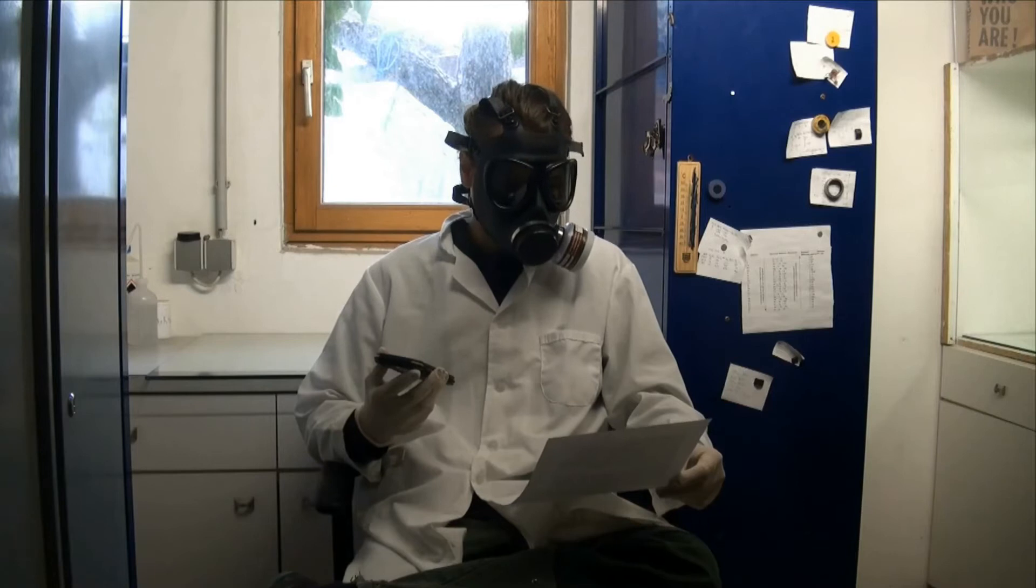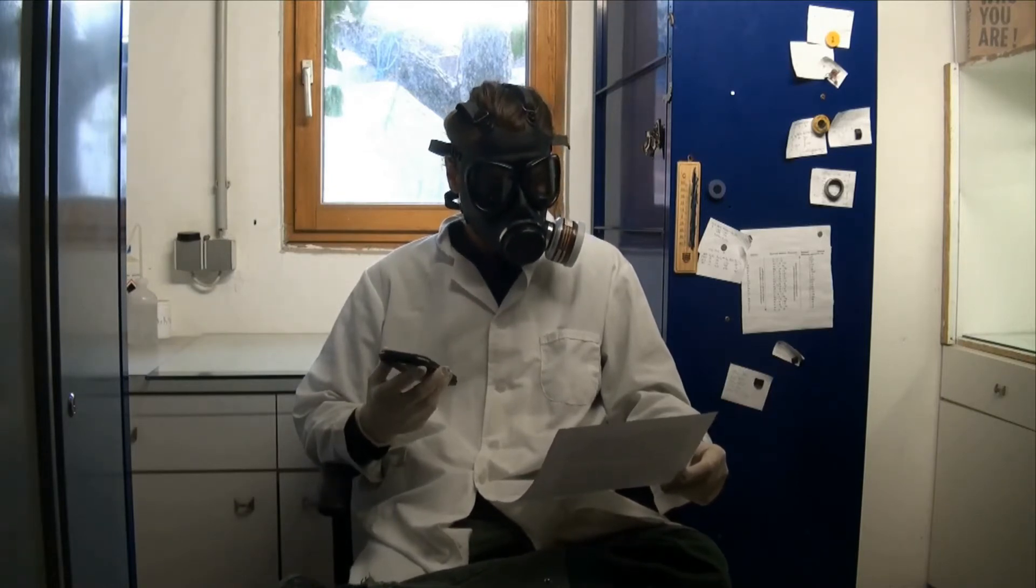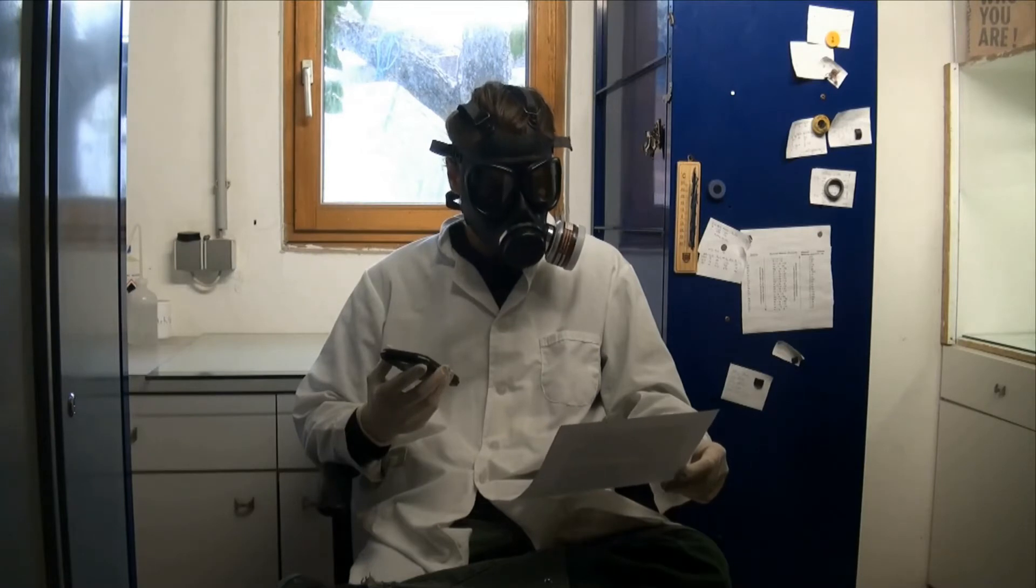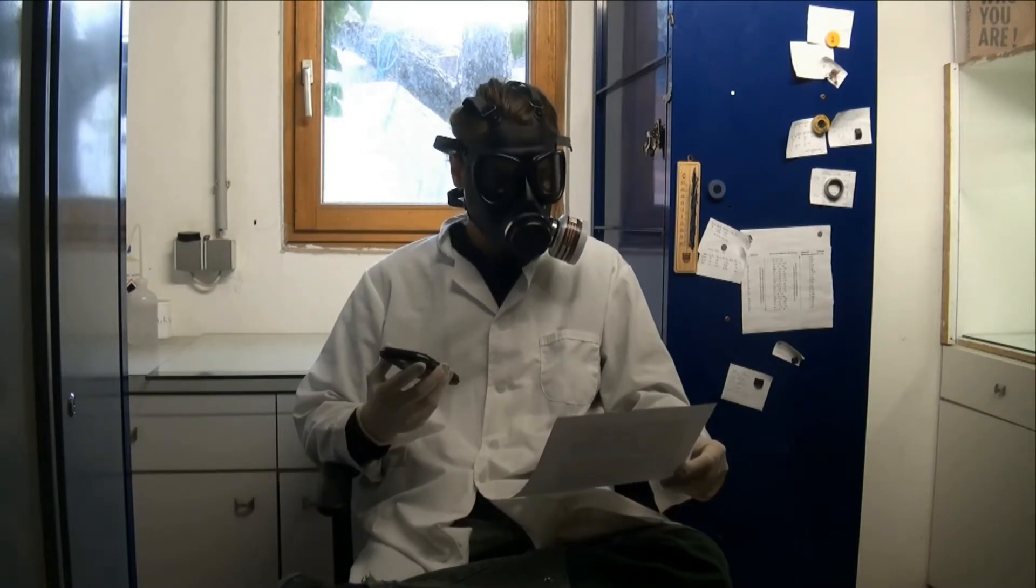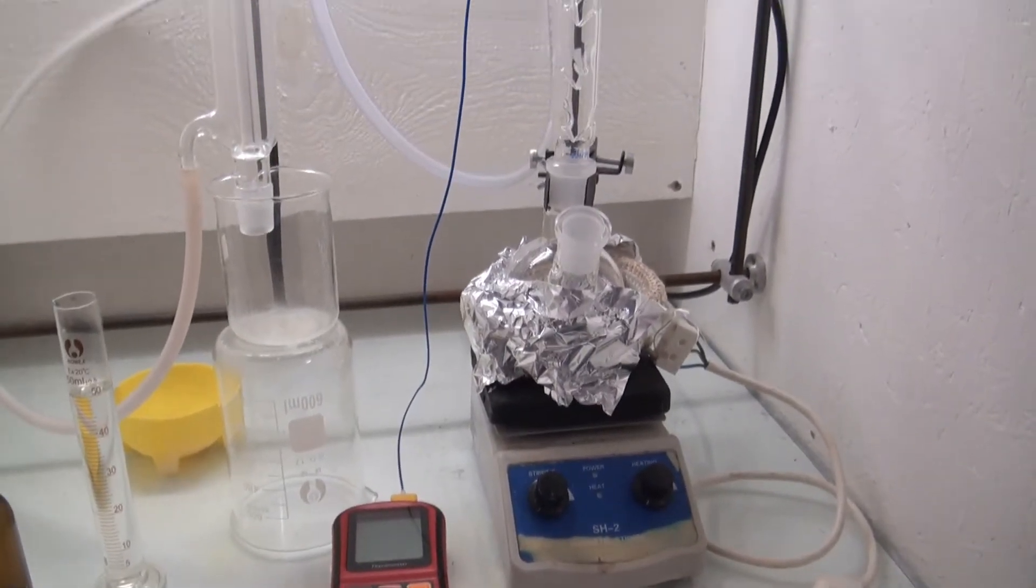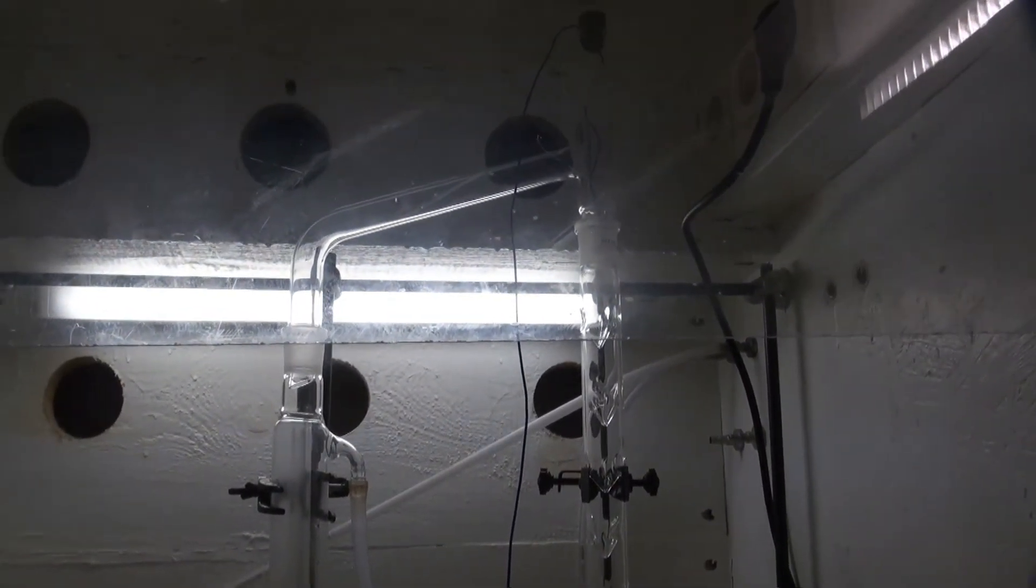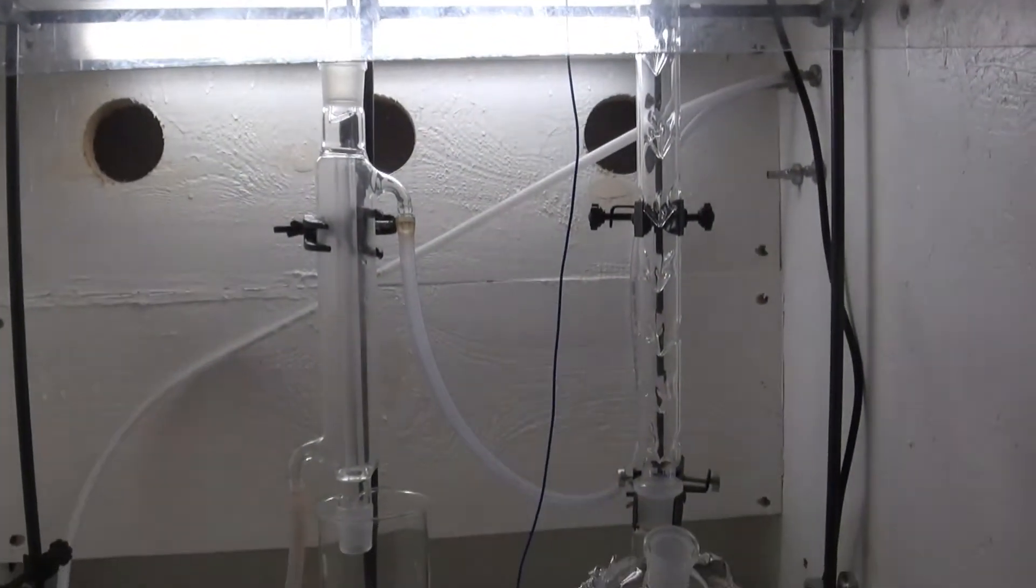From this I was able to find out that I had 115ml of 44% nitric acid. Next I set up a simple flask connected to a fractionating column with a distilling arm and a thermometer adapter. To the distillation arm a condenser was connected.